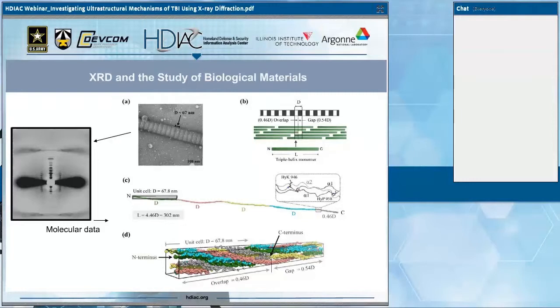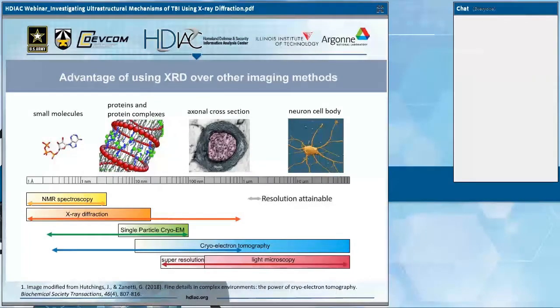All of those structural levels are combining to give the diffraction that you see on the left. However, even though it's very complicated, that middle section, what we call meridionals, through the vertical central section of the diffraction pattern is not overlapping with anything else, and is actually quite straightforward to extract, and gives a great deal of insight into what's occurring through all levels of the structure. And that's the principle that we take for the diffraction that's arising from the myelin of the neurons that we used in our study.